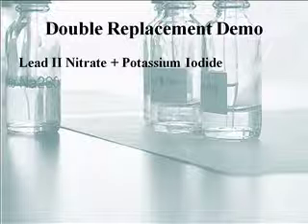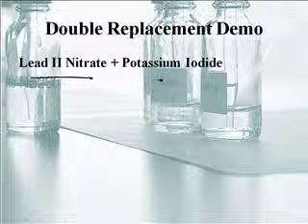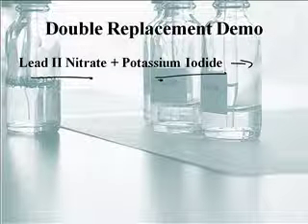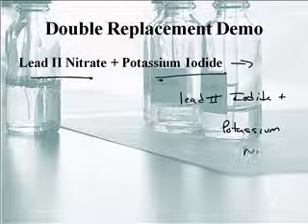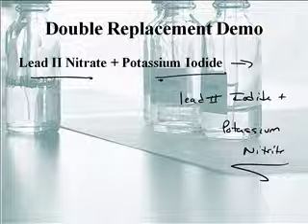There you go, Mr. Sams. That was cool. So this is the reaction: lead(II) nitrate plus potassium iodide formed lead(II) iodide and potassium nitrate. Now we usually like to write the symbols, because we don't like words. We'll teach you how to put all the symbols together in another podcast. This is just so you can identify and know which type is which.